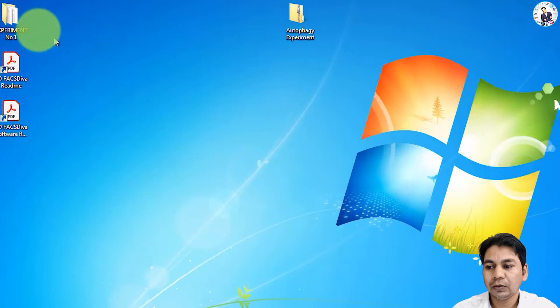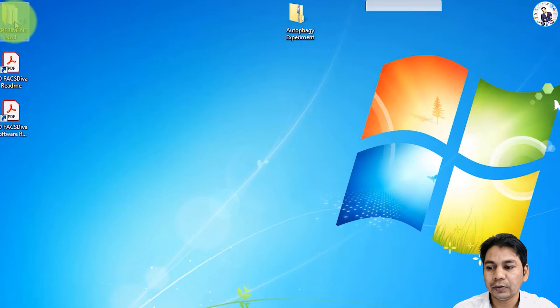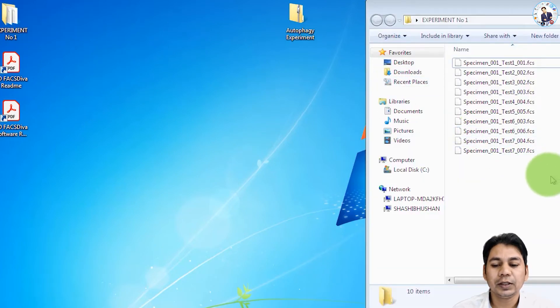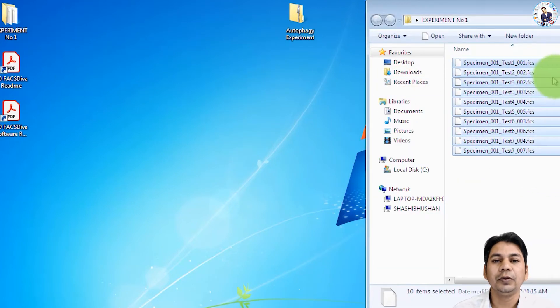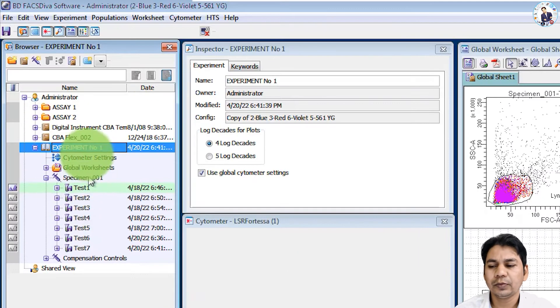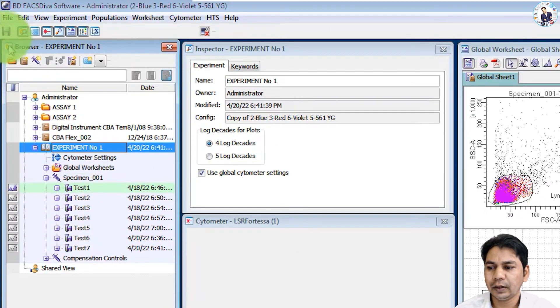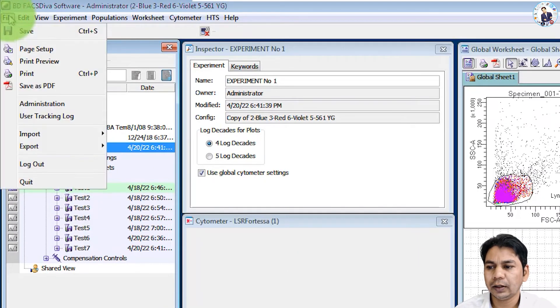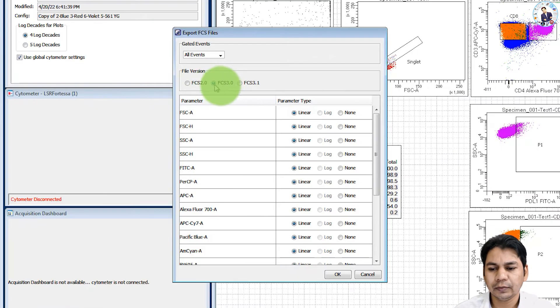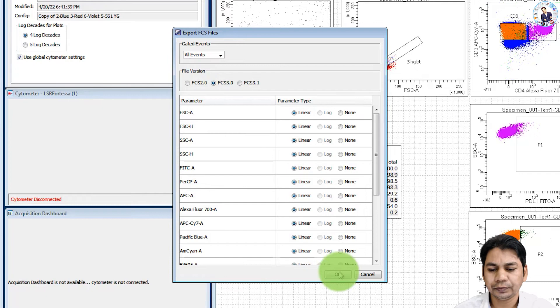Now if you open this folder, you can see all the files of this experiment are present in this folder and you can also export the FCS file.